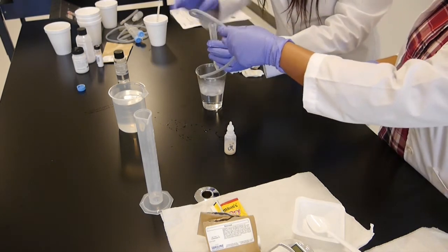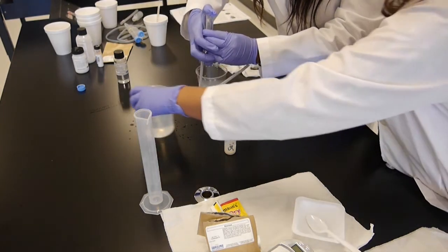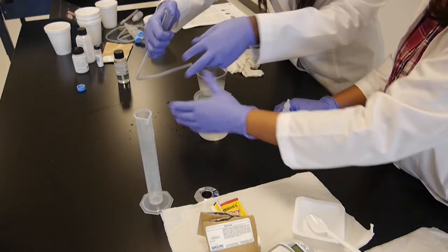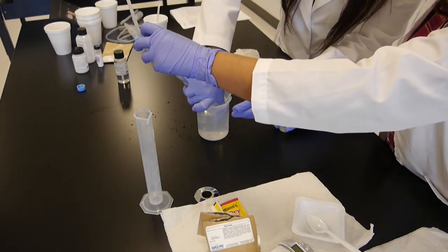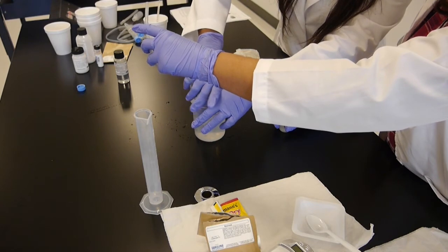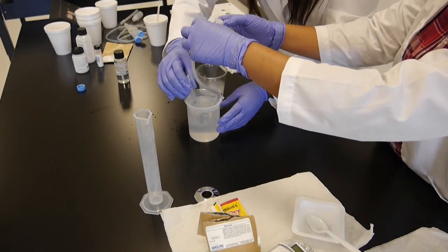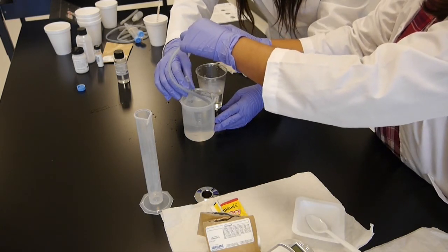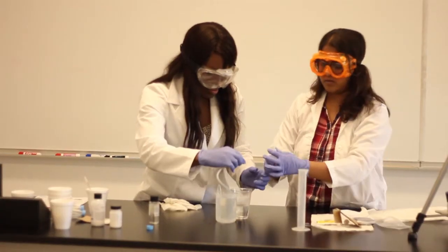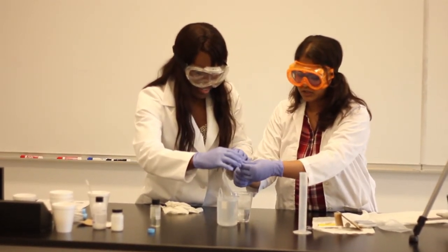Okay. And then you want to hold your thumb over it like this. And so we fill this part out because we realize that if it's not filled, it's hard to actually get this into it. So like that. Let's see how we did. Yay, we did well. Very good. And then attach the other end of the tube to the dropper end of this. Oh, there, okay. It has to snap on.